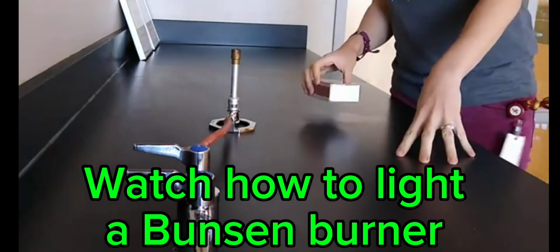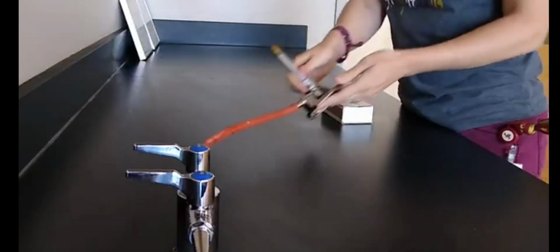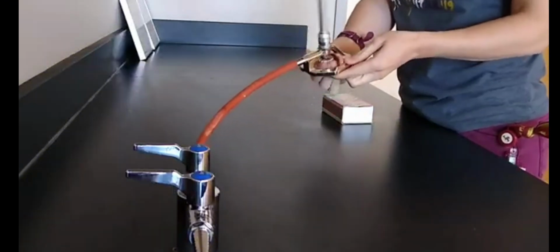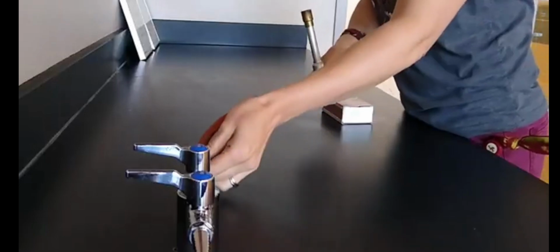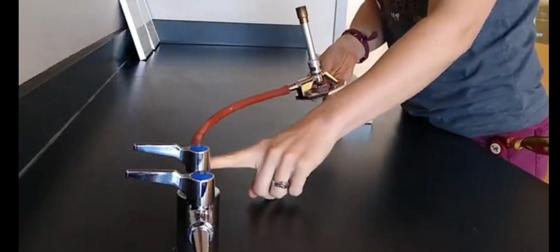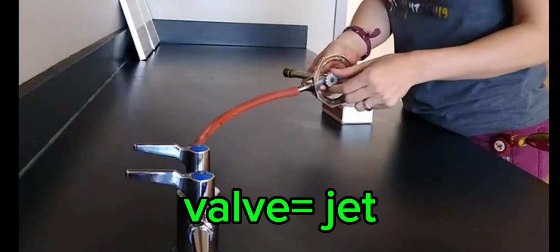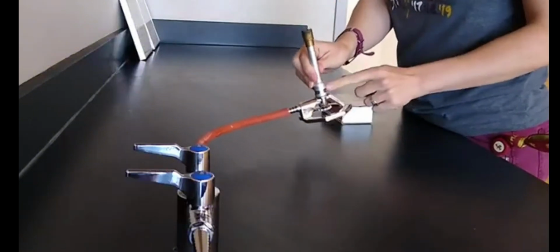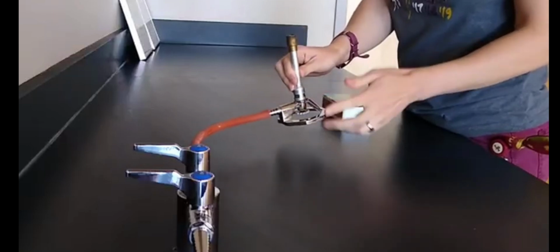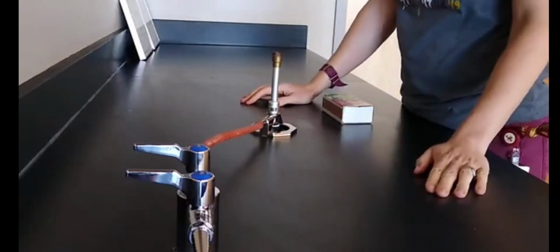Okay, so this is how to properly light and adjust a Bunsen burner. We have our Bunsen burner here, and it has several components. We have a rubber tube that is connected to our gas jet coming out of the lab table. We have a valve on the bottom that controls whether or not gas can flow through the Bunsen burner. And then we have our air vents right here. So we're going to use all 3 points of control to properly light and adjust a Bunsen burner.